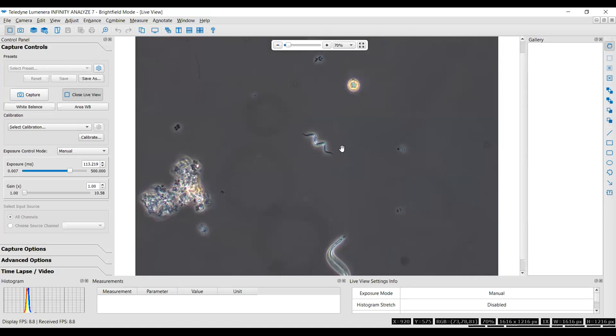We were right all along. We talked about this years ago that we couldn't see why they were different. Yeah, and so I class this as a thin Raphidiopsis, because it's way different, right? Look how different it is from this one. The Dactylococcopsis is quite thin. Even thinner. Yeah, way thinner than that.